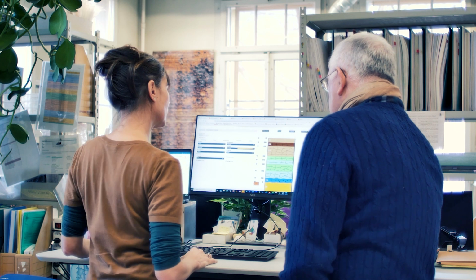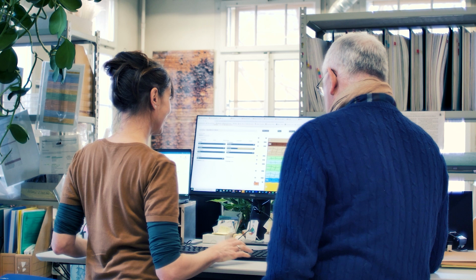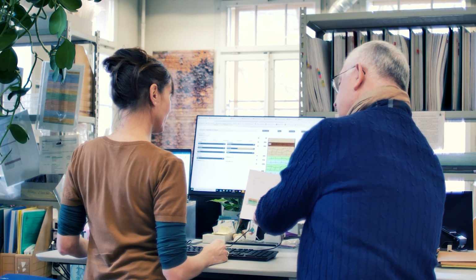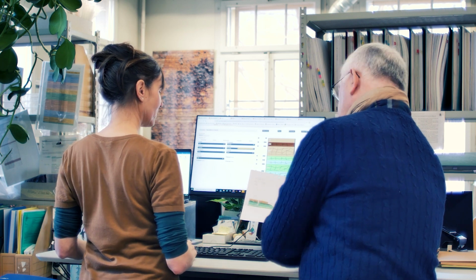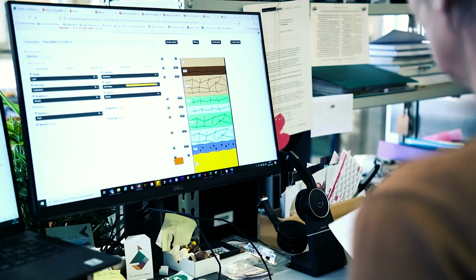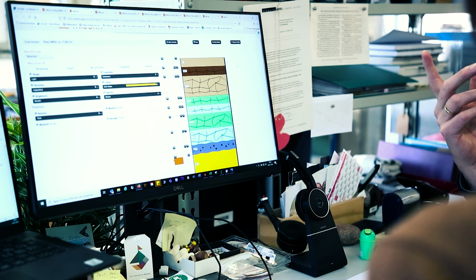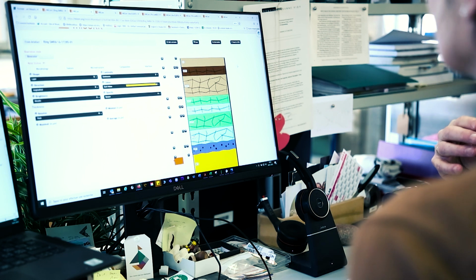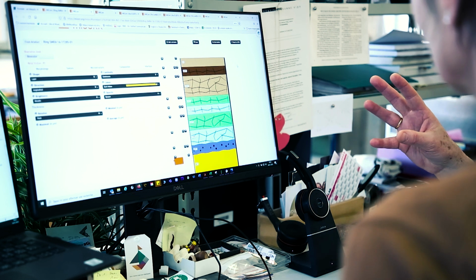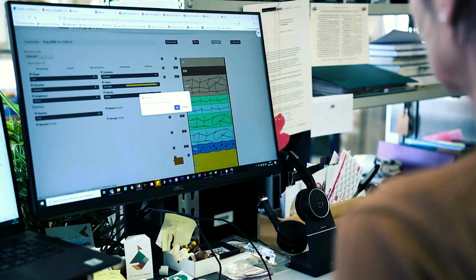Okay, so now you have managed to build your whole stratigraphy. So again, it has to be relevant to what you observed with your binocular microscope, but it seems to be. The system can read that, but you have to question the database. It could be that in the database we have an object which has exactly the same stratigraphy. So for that you have to click on Find Similar.